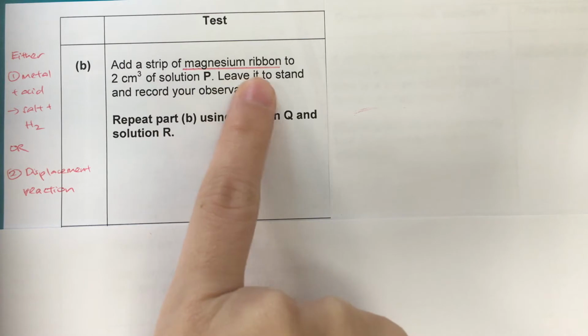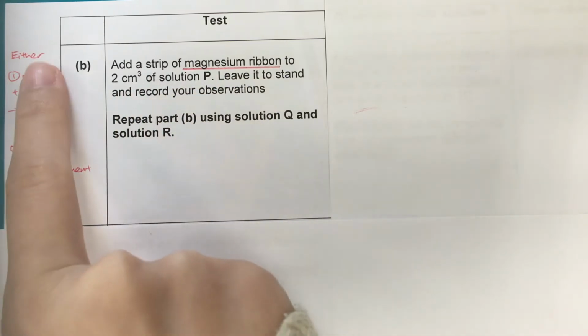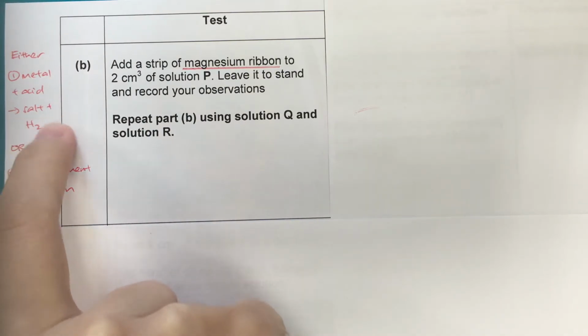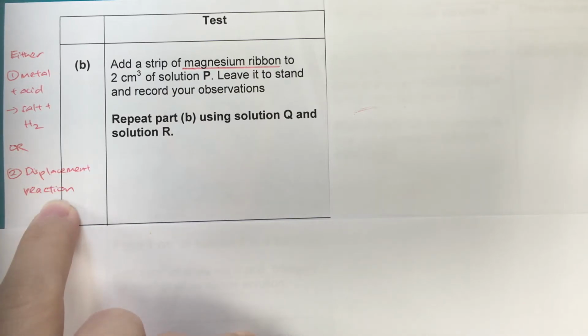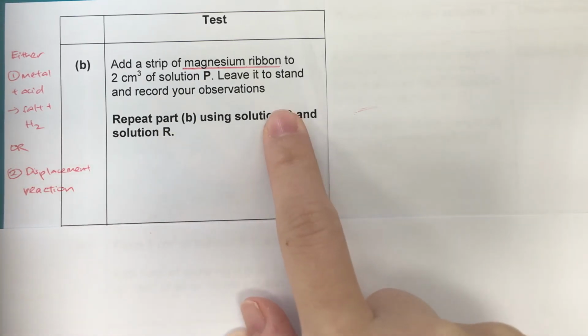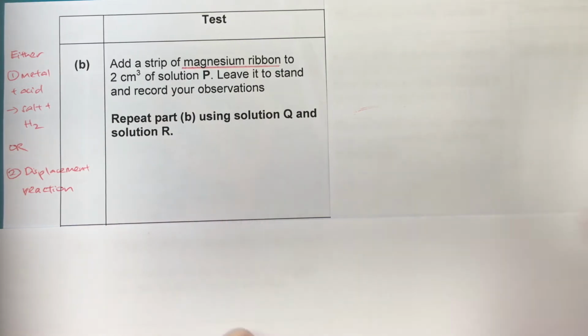Okay, next, when you add magnesium ribbon, which is a metal, it could be a metal reaction with acid to get salt and hydrogen gas, so you may see any effervescence, or if it's a metal, it could be a displacement reaction where a more reactive metal displaces a less reactive metal from the salt solution. So let's see what we get with this test for P.